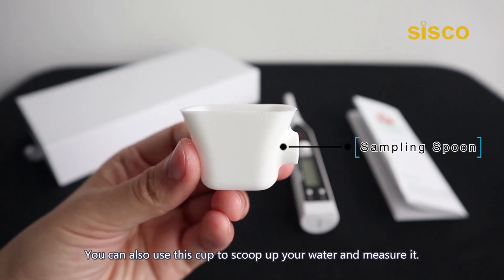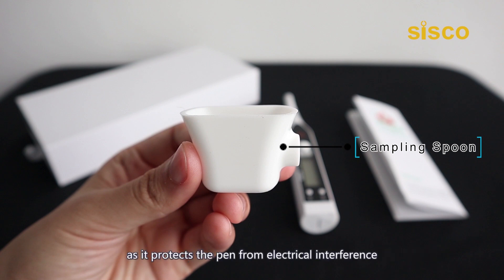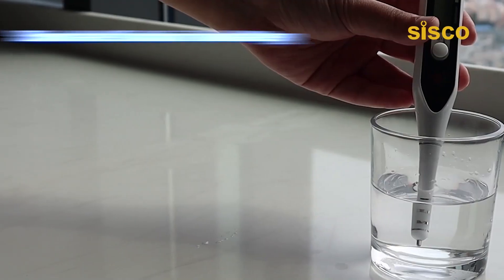You can also use this cup to scoop up your water and measure it. This is a clever accessory for use with conductivity-based salinity probes, as it protects the pen from electrical interference that may happen in aquariums equipped with pumps and heaters, and also avoids polluting the water sample when pouring some sample into the cup for non-contact measurement.